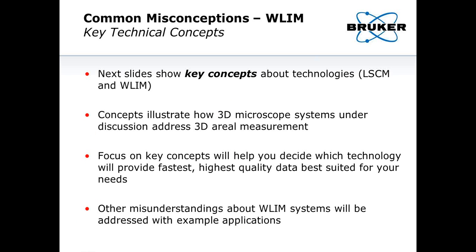So some of the key concepts, in the next few slides, I think it's two or three, are key technical concepts that go along with understanding better some of the common misconceptions or misunderstandings about coherent scanning systems and how the different technologies that we've been talking about so far perform their function of making height maps. The concepts are meant to illustrate how these two systems under discussion address a 3D areal measurement. That's one of the concepts. And focusing on these will help people decide what is the right choice for their application or their need.